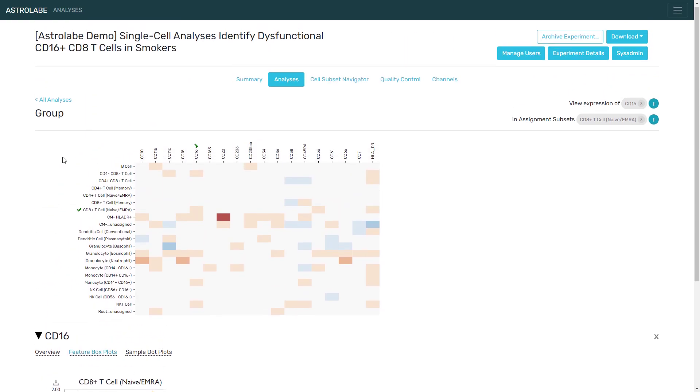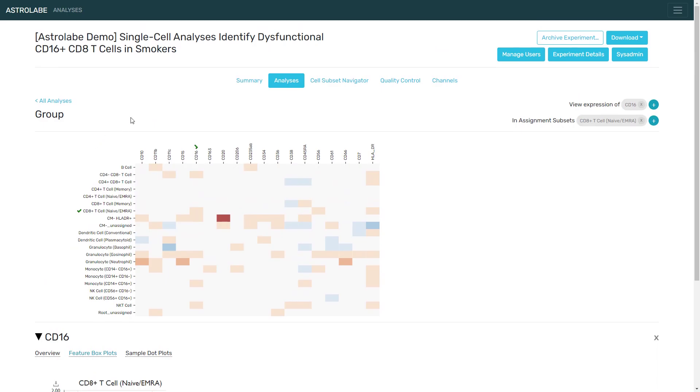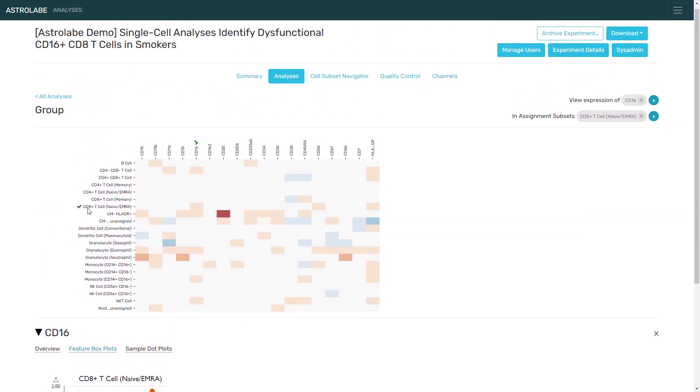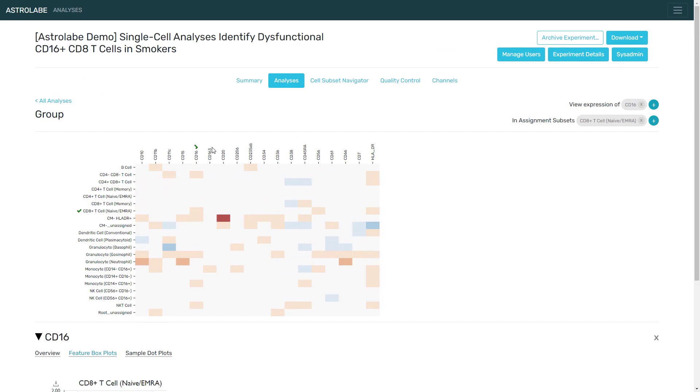Going back to the title of the paper, single-cell analyses identify dysfunctional CD16 positive CD8 T cells. So Astrolabe reproduced these results very nicely, and it only took us a few mouse clicks to get here.